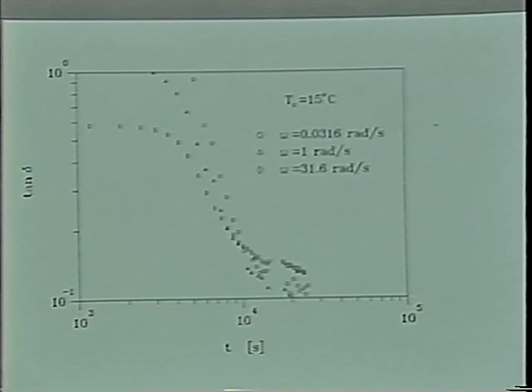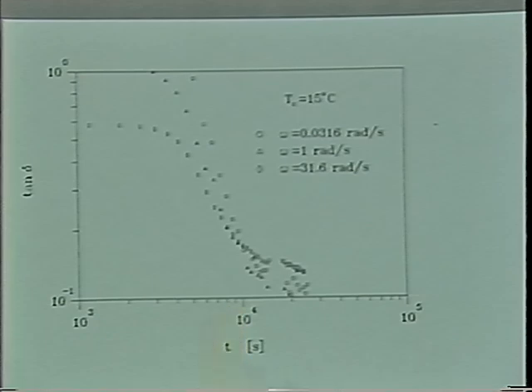When you're working with samples like that, and somebody tells you, when you supercool to 15 degrees, you have a gel point at maybe 9,000 seconds, that's helpful for designing your experiments, and it's easy to get this way. I don't know any other method which gives the result that directly and that handy.